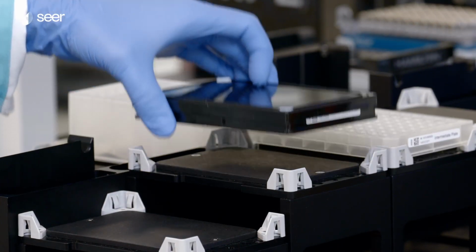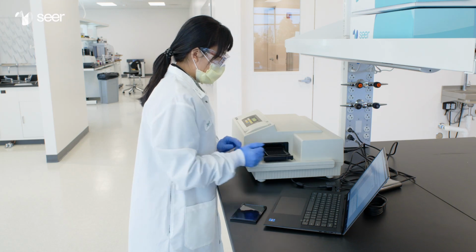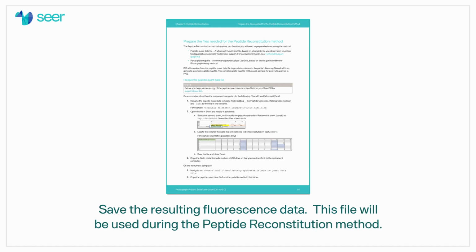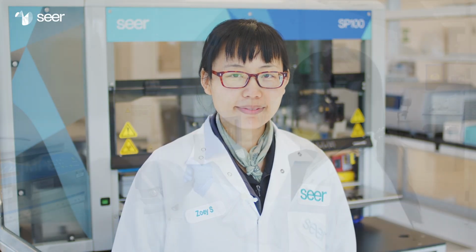Remove the black quantitation plate from the work deck and move it to the microplate reader for fluorescence analysis. Save the resulting fluorescence data. This file will be used during the peptide reconstitution method. Select Continue. Now we'll dry the peptides.